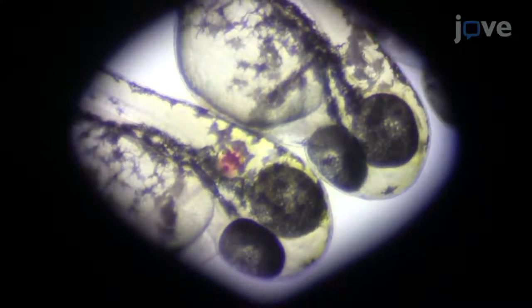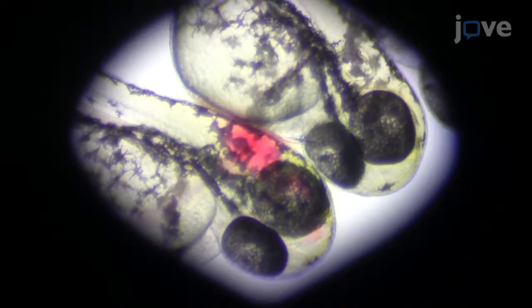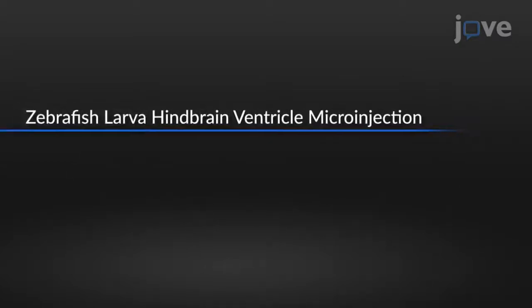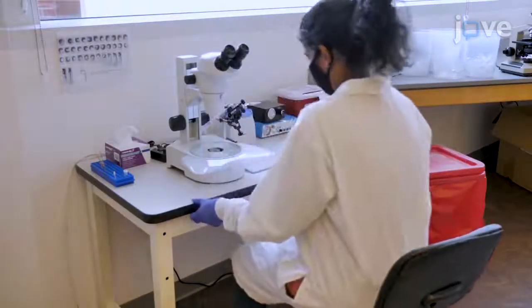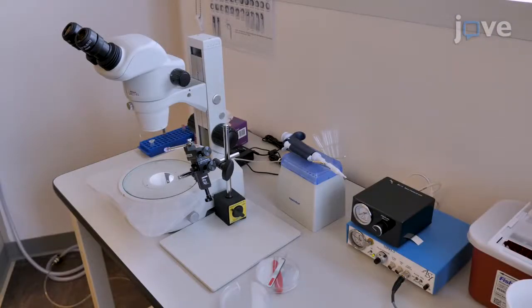Microinjection of spores into larval zebrafish is a difficult technique that requires considerable practice before consistent and reproducible results can be achieved. To perform microinjections, use a setup supplied with a pressure injector, back pressure unit, foot switch, micropipette holder, micromanipulator, and a magnetic stand and plate, all connected to a source of compressed air.